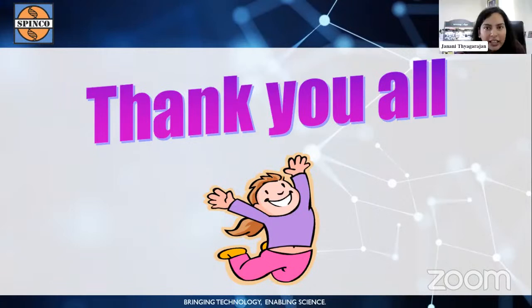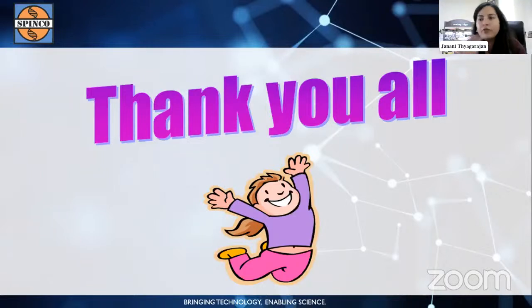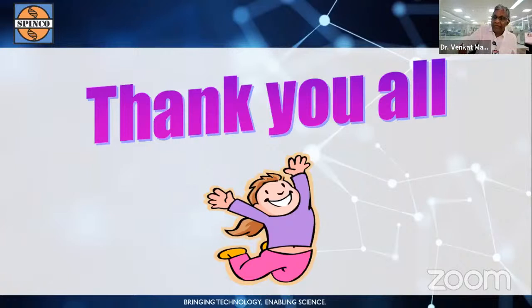How do we do qualitative analysis in LC-MS? Again, that is a separate session that we are going to talk about. What is the molecular weight limit for mass spectrometry? For a quadrupole, it is around 2000. If it is MALDI, you can go up to 300K, 400K like that.